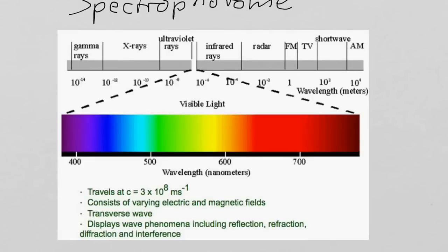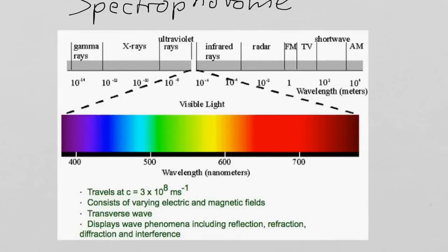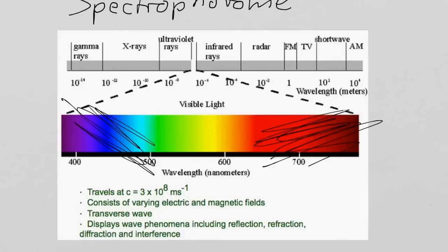It absorbs everything but the green. Exactly. It absorbs light in the red wavelength, and it absorbs light in the blue wavelength range. So what's left is a greenish color.